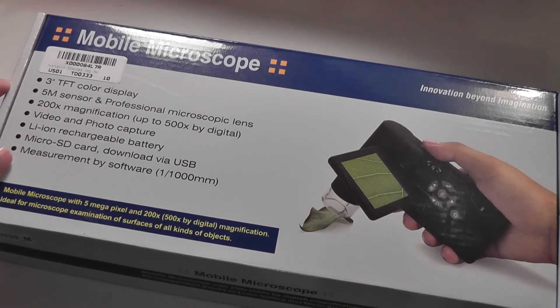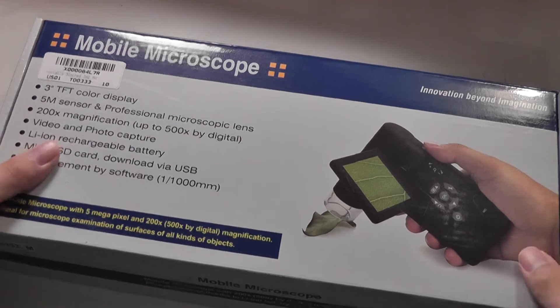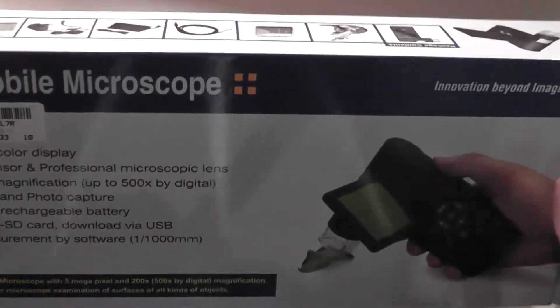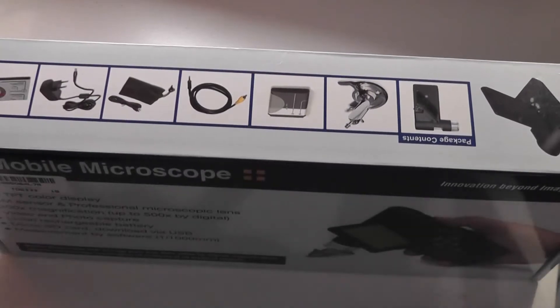A rechargeable lithium-ion battery uses a Nokia-inspired battery. There is a microSD card slot that you can connect, sync, and download via the USB port, and measurement by software. There's a CD-ROM included inside. Pretty nice in terms of packaging and presentation. It retails for about $80 online, and it arrived in about three days after I ordered it.